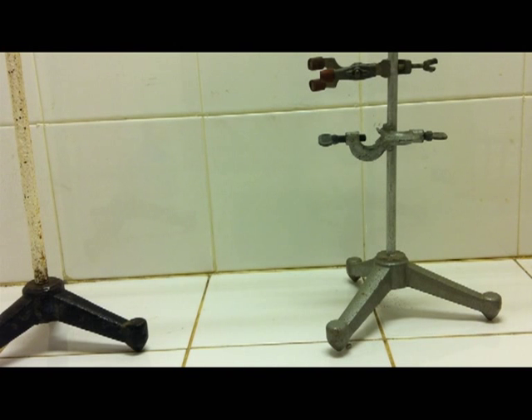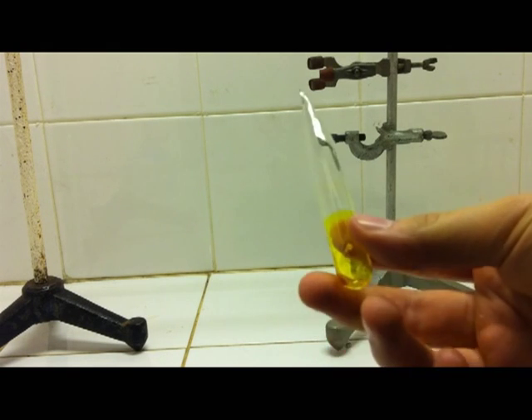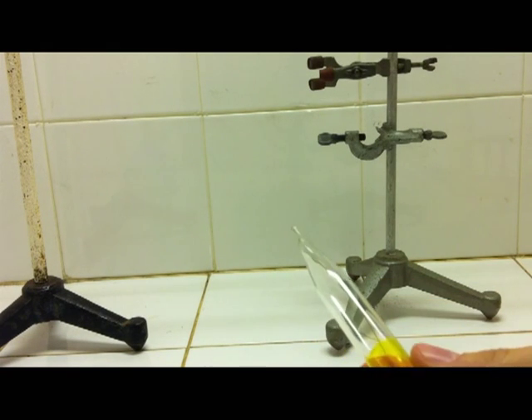Further, it is possible to close the test tube to avoid moisture getting into the layer and destroying the phosphorescent system. So it is possible to close the test tube like an ampoule and keep the phosphorescent layer working.